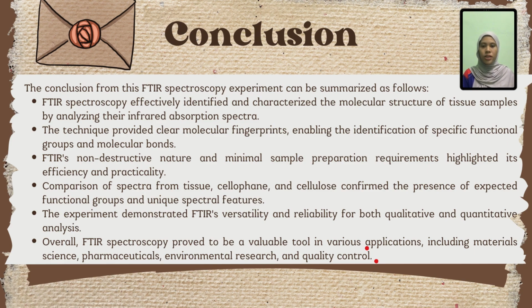Next, comparison of spectra from tissue, cellophane, and cellulose confirms the presence of expected functional groups and unique spectral features. The experiment demonstrated FTIR's versatility and reliability for both qualitative and quantitative analysis. Overall, FTIR spectroscopy proved to be a valuable tool in various applications, including material science, pharmaceuticals, environmental research, and quality control. Thank you.